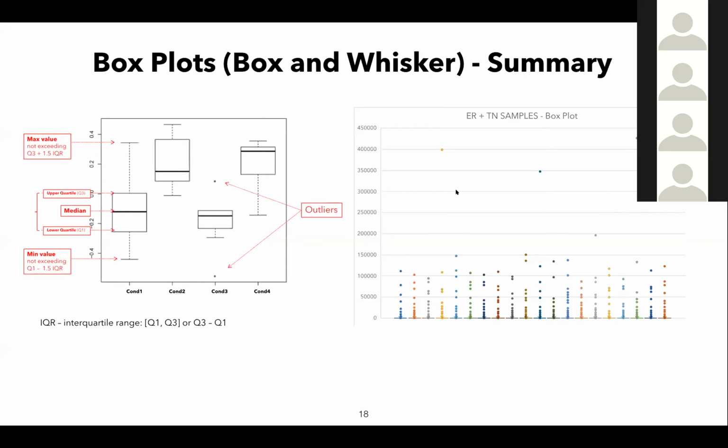Because of this, all kinds of methods that are sensitive to the variance of the data are going to be a little bit less sensitive, because the majority of our data is way down here and is not fully represented. To address this, we're going to take a different data set and we'll walk through how to adjust this problem. This is a common problem with next generation sequencing. A lot of the values are very small, but some are very high.